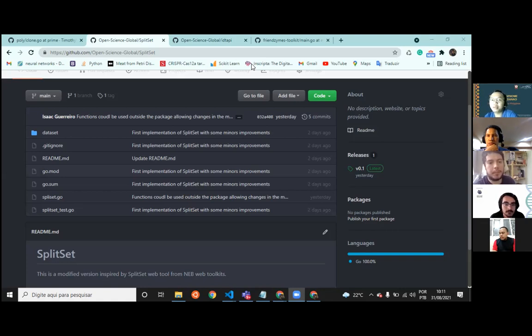I think so far that's it. Nanopore sequencing is very direct and to the point. It doesn't need highly advanced technical training, unlike the Illumina platforms, which are quite complicated. So that's also an advantage of nanopore sequencing.